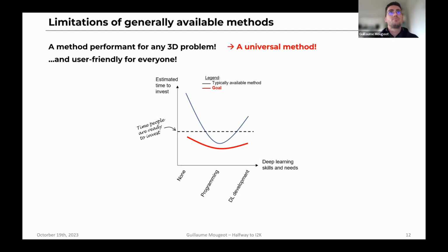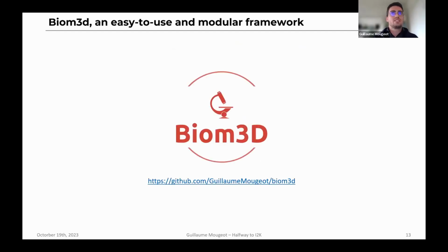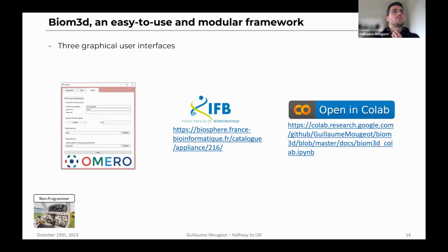And so Biom3d is an attempt to do that. Basically, to have a method that can solve any 3D problem on one side, and that can address the expectations of a broad spectrum of users. And that's what we talk about today.